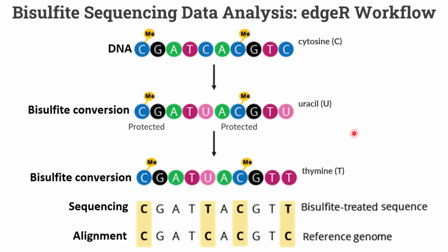So here is the basic method for bisulfite sequencing. You can see it is very easy to understand how this method works. After the short introduction, we can start our data analysis in R.